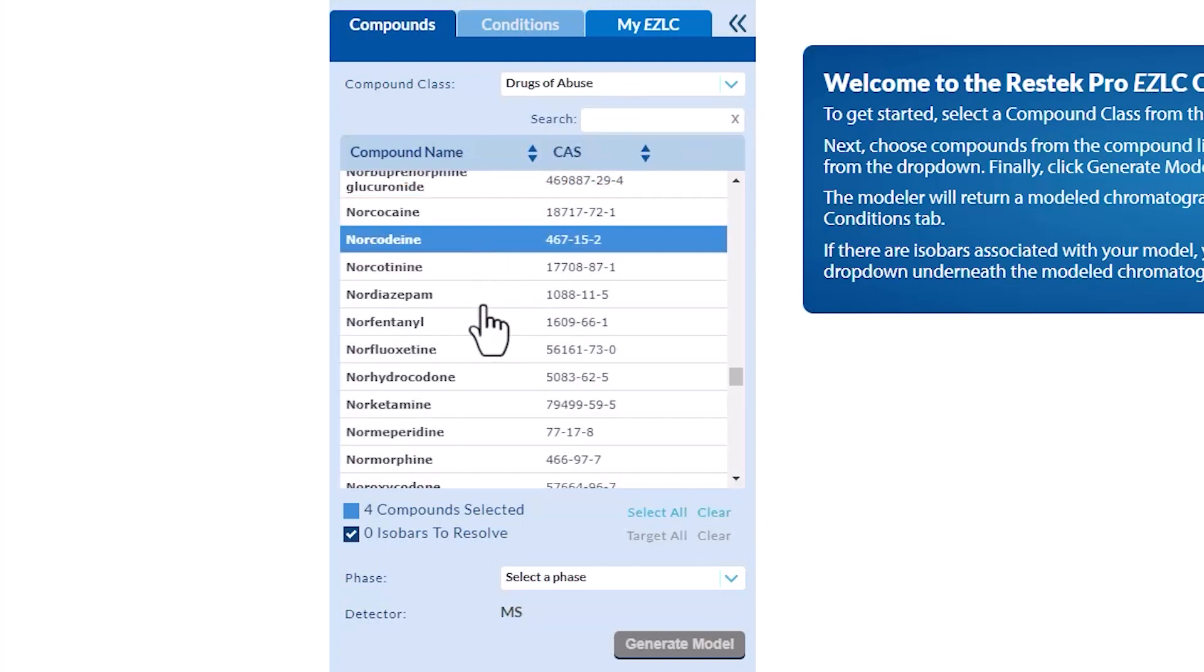As you add compounds, a blue box with a white checkmark may appear in the compound row beside the CAS number. This indicates the compound is an isobar of another compound you have selected.